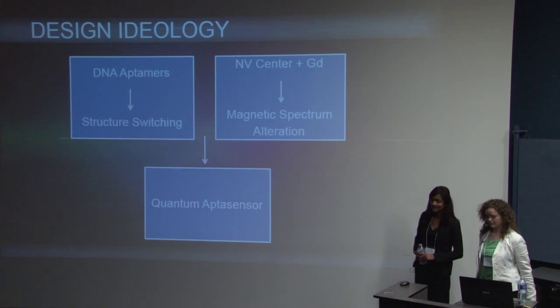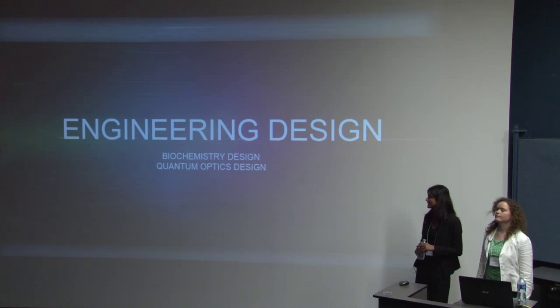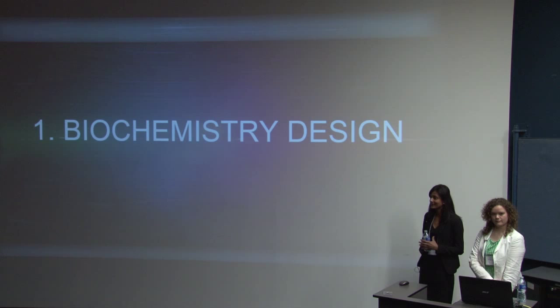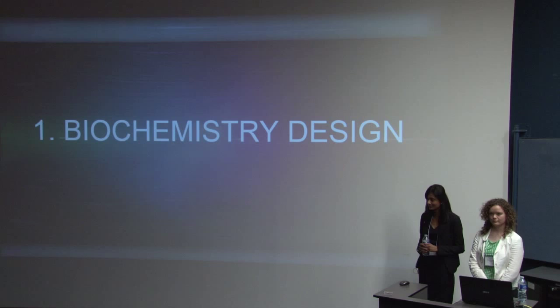For our engineering design, we have divided our design, for the ease of fabrication and also for the ease of this presentation, into two parts: the biochemistry design and the quantum optics design. The goal of the biochemistry design is to attach DNA aptamers to our diamond surface. Diamond is known to be a very hard and inert surface, which makes it a complication in our case to attach DNA aptamers to the diamond. So this was our first problem that we had to overcome to make this design even possible.